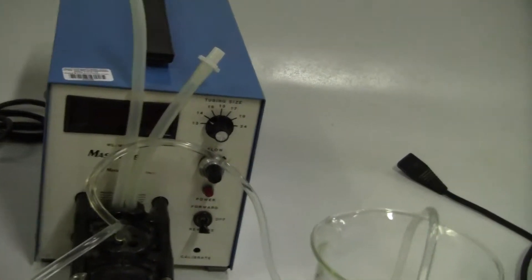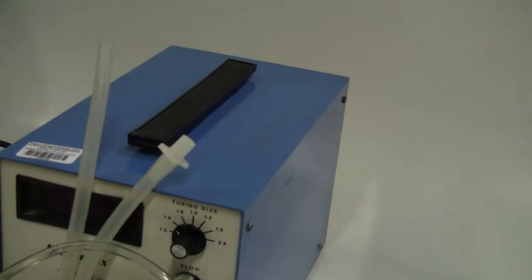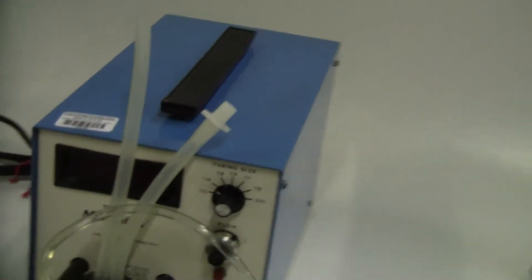Hi, this is Jim from HiTechTrader. We're looking at a MasterFlex peristaltic pump, Model 7523-00.